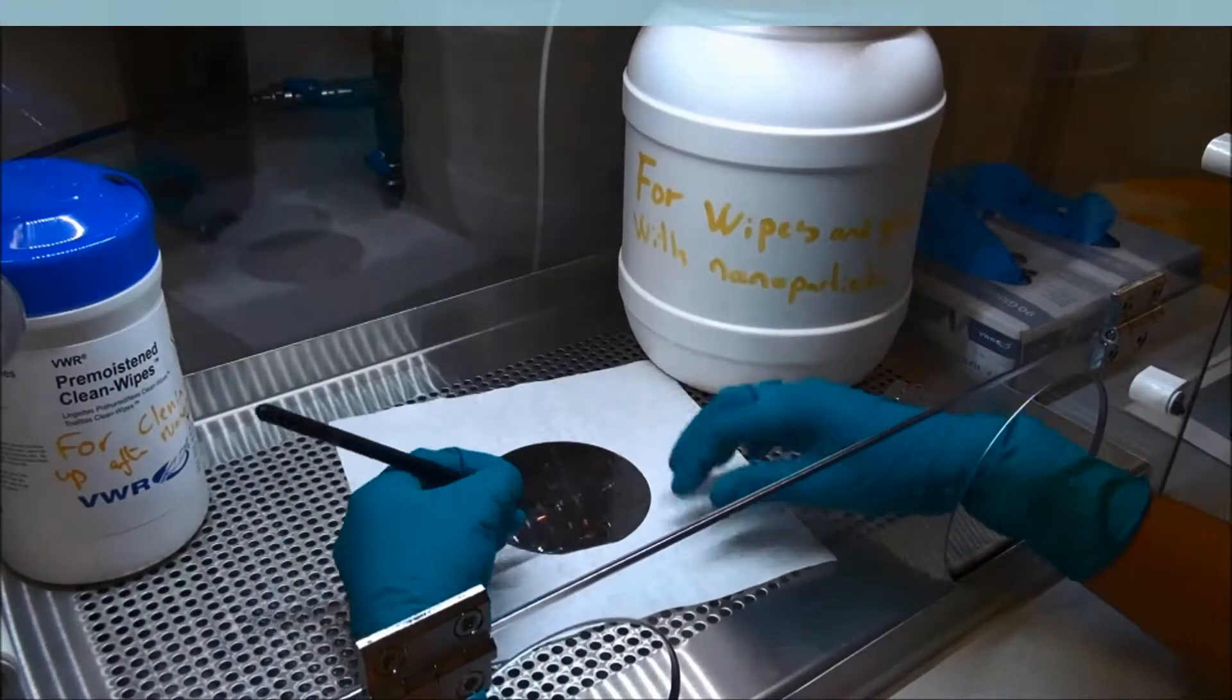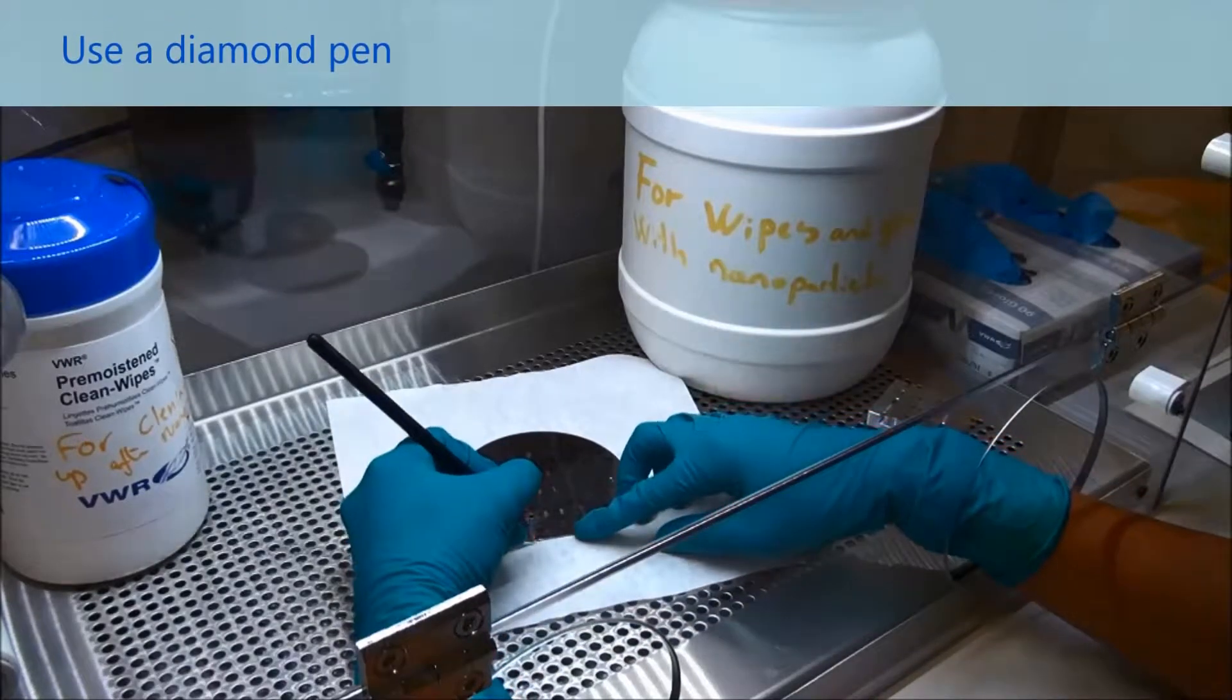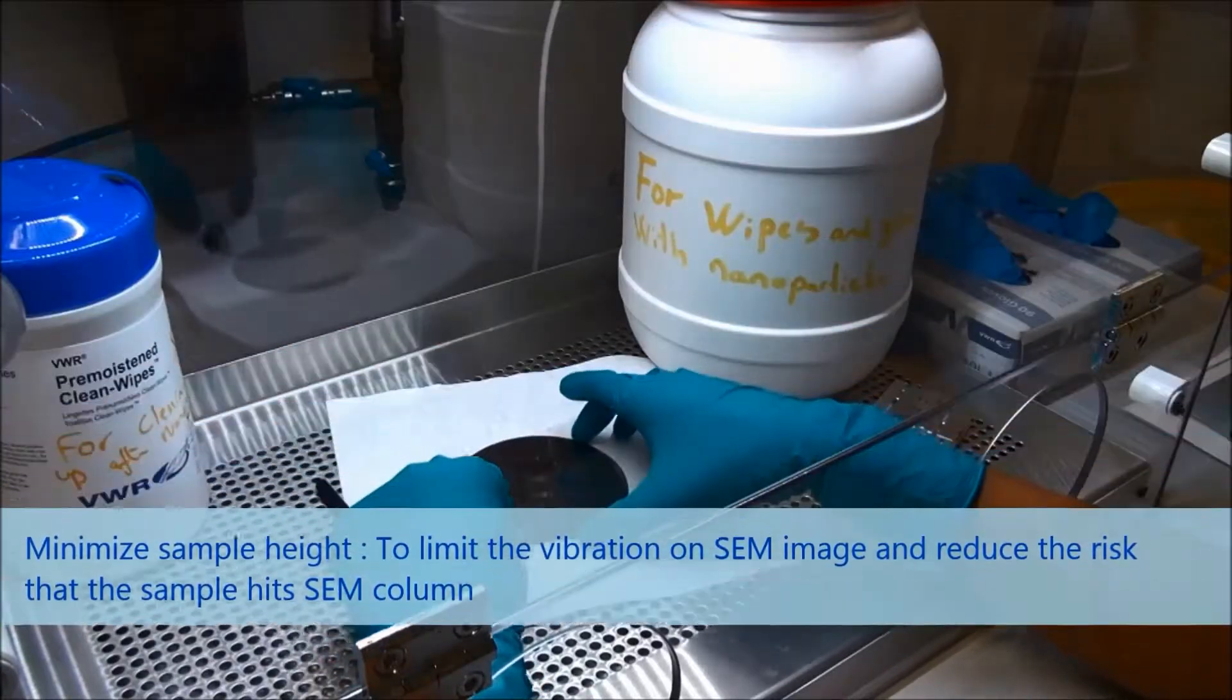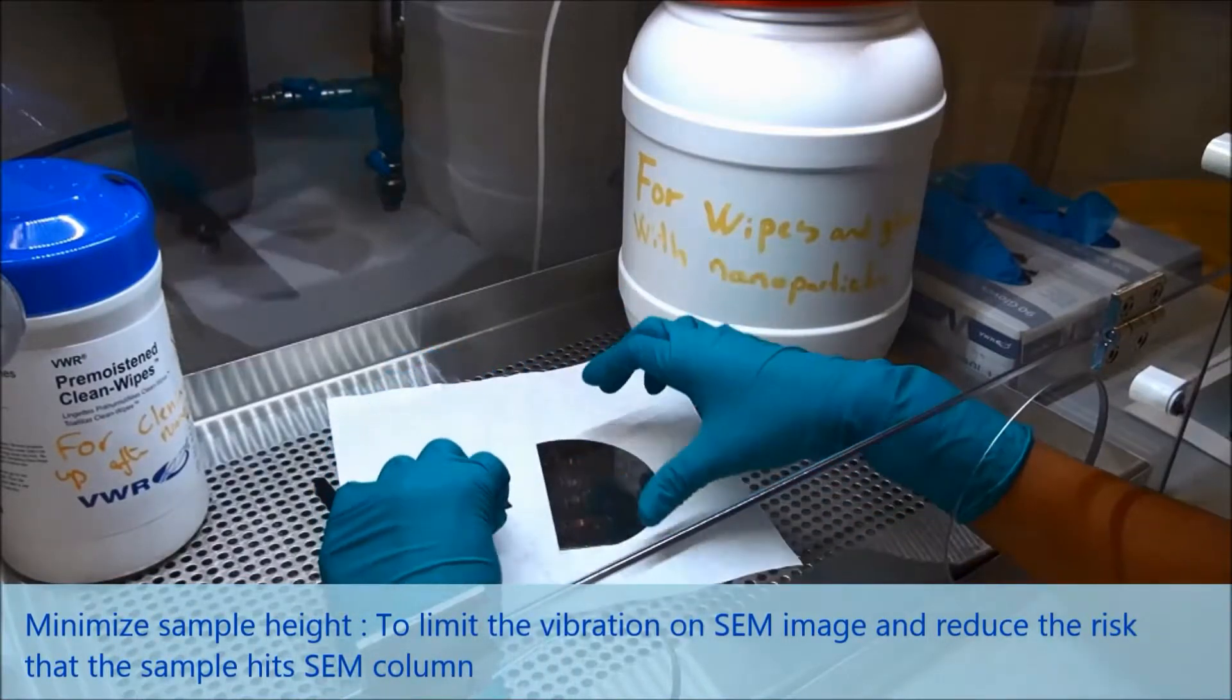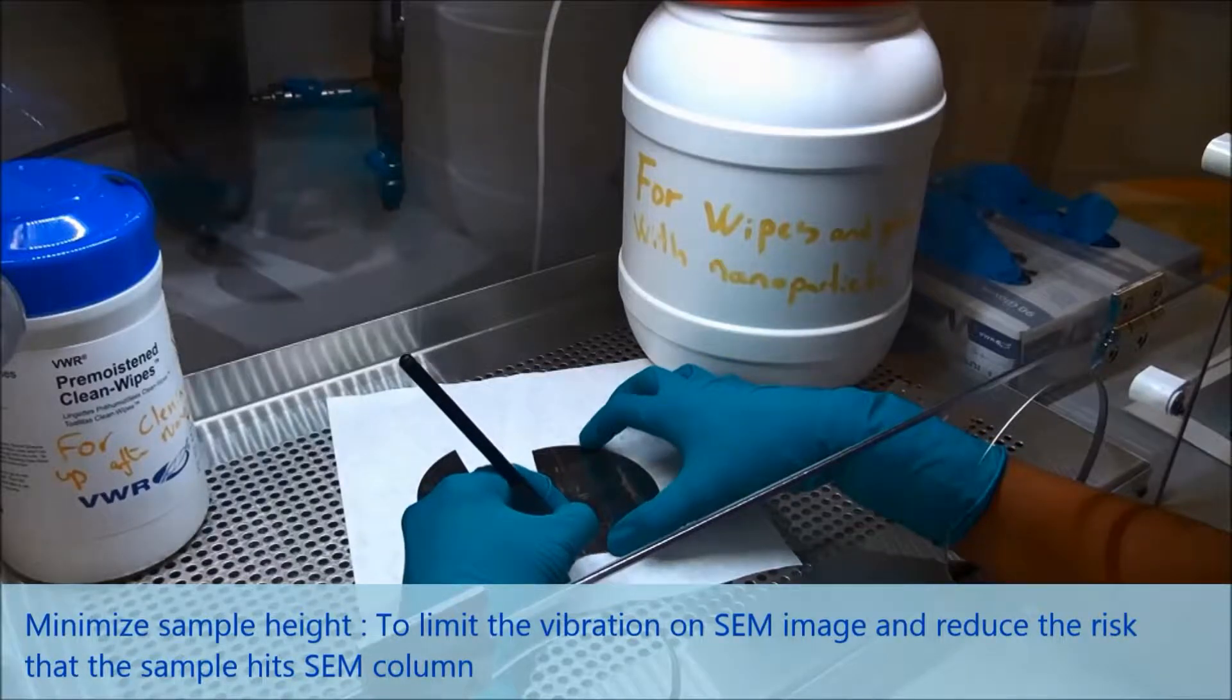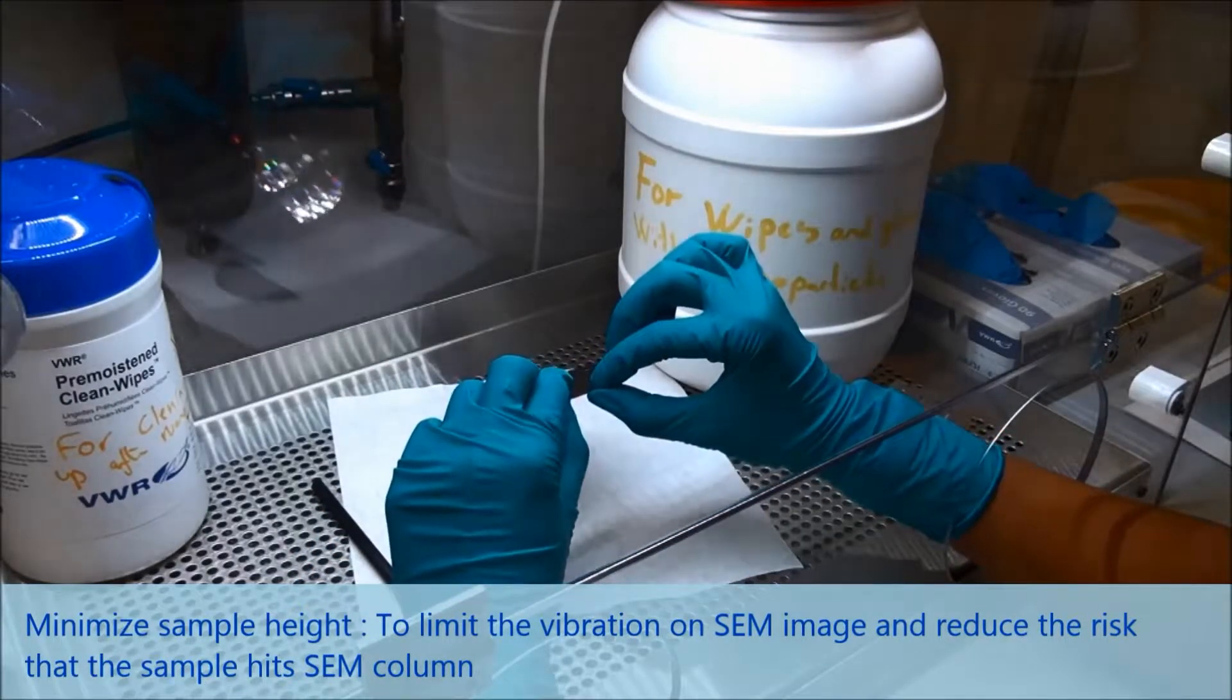Now be ready to cleave the wafer. You can make a scratch on the wafer and just smoothly bend the wafer. And now we have it, and also on the other side here, the same way.